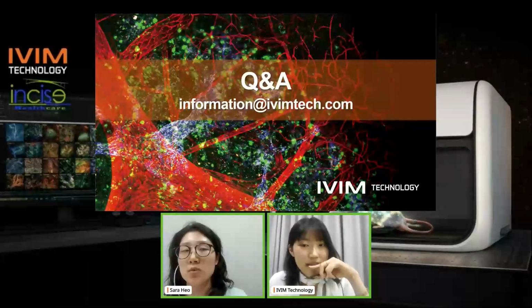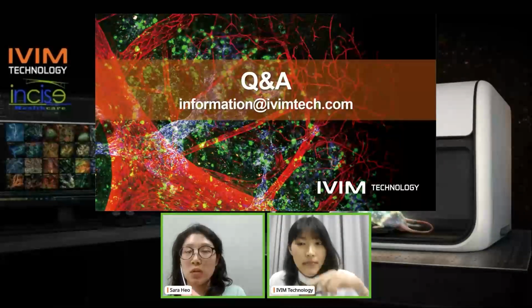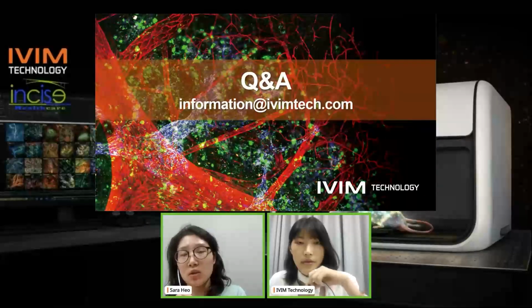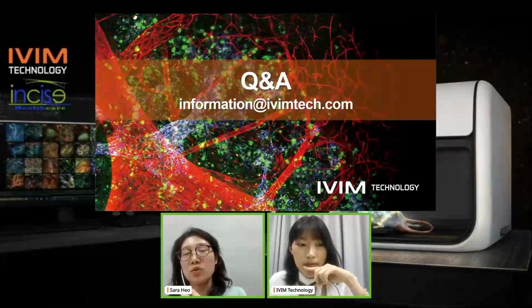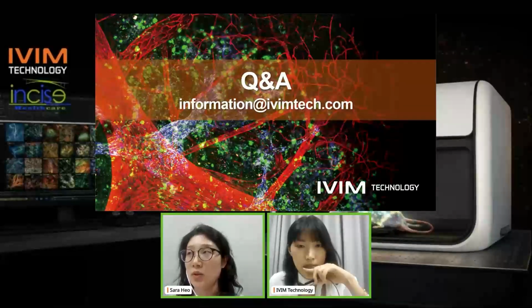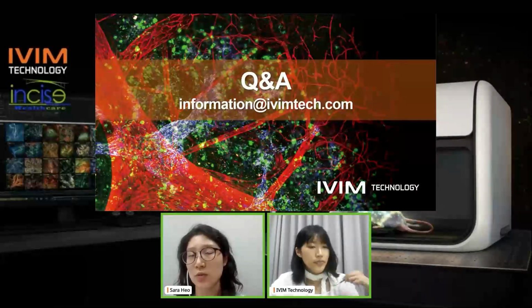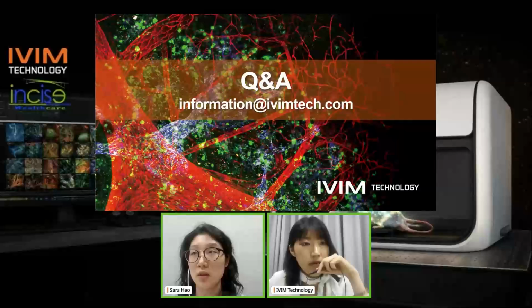That is usually allowed if you use a 2-photon, usually up to more than 200 micrometers. I guess the technique that you're asking about is that we use the 2-photon. Usually for the brain, we use the 2-photon to image the brain part because it goes in depth.